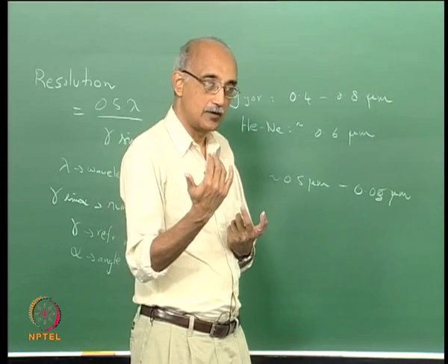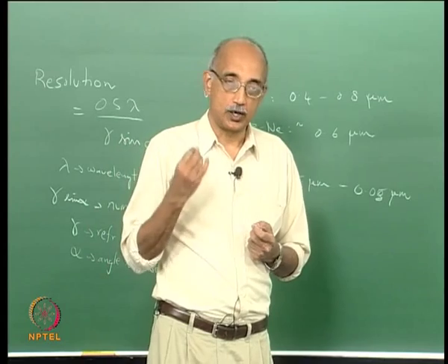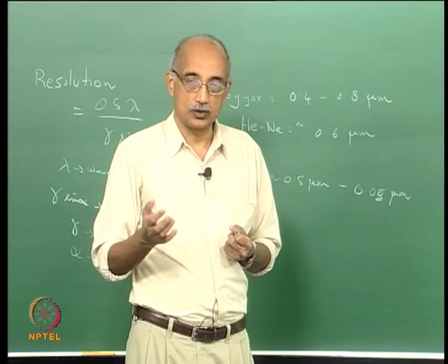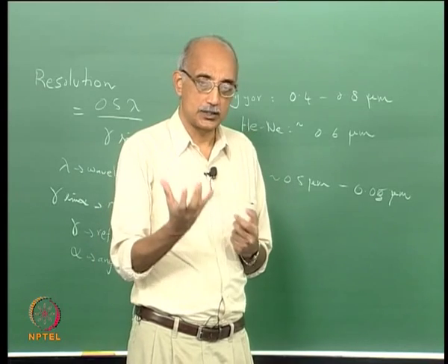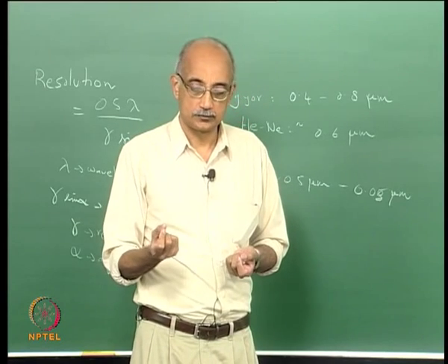And same thing, when you have dust laden air, your visibility is very poor, right? The reason again is the same. Particles that are suspended in air have the ability or the propensity to affect transmission of light through that medium. And similarly, when you have particles that are suspended in liquids, there is a corresponding reduction in light transmission.